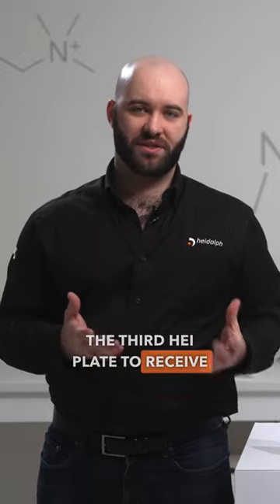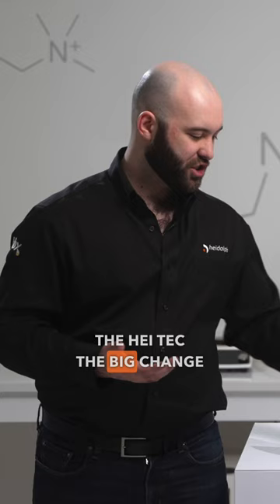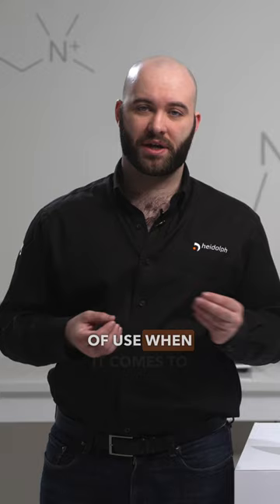The third Hei-Plate to receive the update is the Hei-Plate Mix 'n' Heat core plus. This hot plate is replacing the Hei-Tec. The big change here is that we now have two knobs — one for stirring and one for heating. This provides additional control and a little bit more ease of use when it comes to changing your parameters.